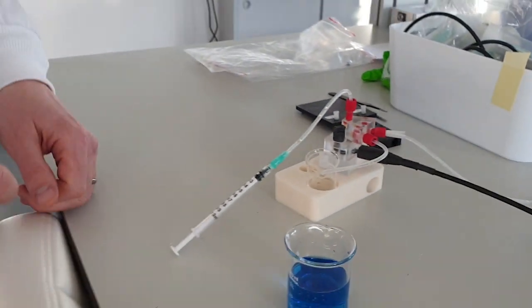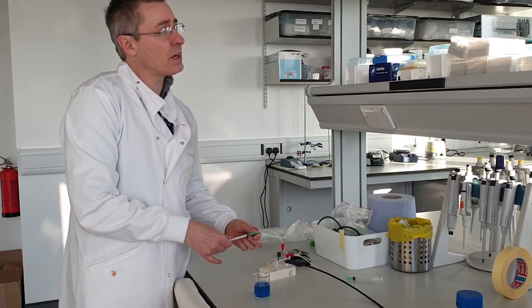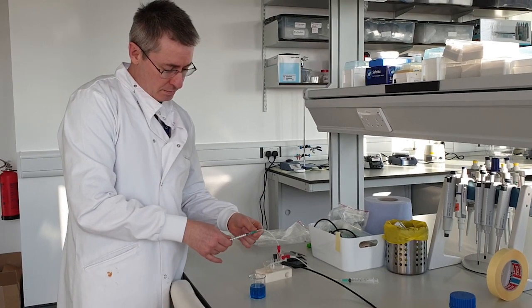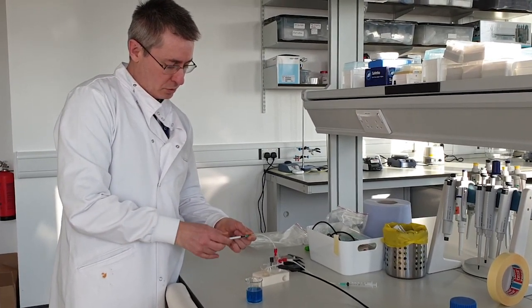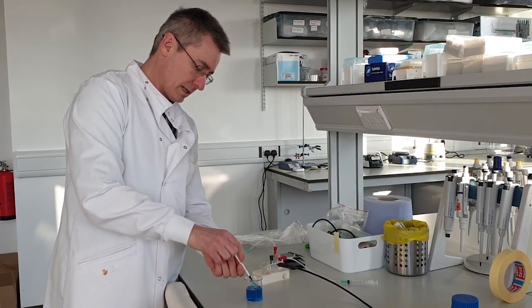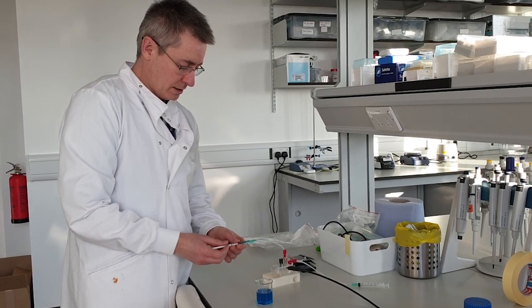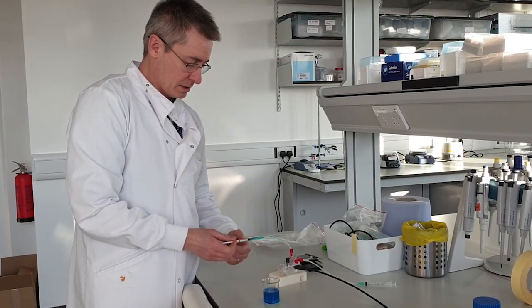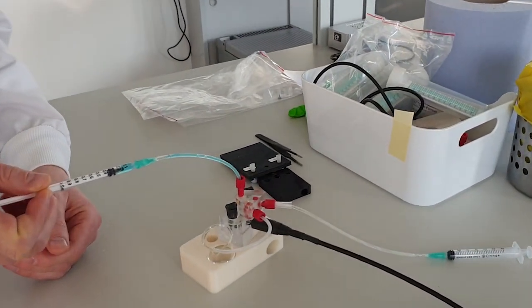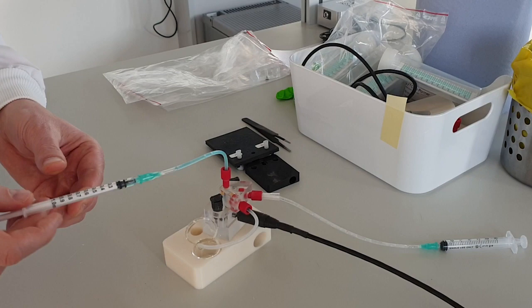I'm going to do a two-step process. The idea with this is, if somebody has a sample or an analyte type — something like a protein, something like a DNA, something like a microbe — they will be able to add that to the sensor. I'll use the blue dye to show that off. You have a sample and you push it; you'll be able to see the liquid front. What's happening here is I'm pushing the sample onto the sensor, and because it's blue dye, I can see it coming out.